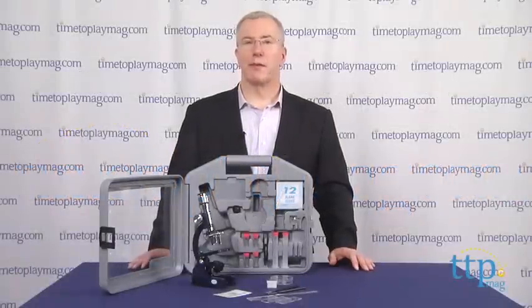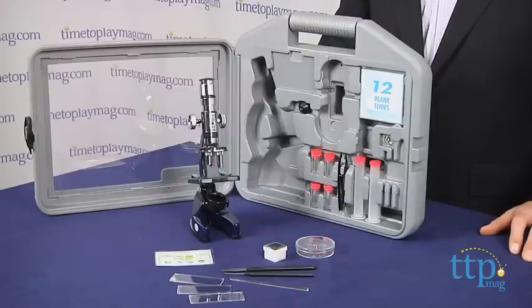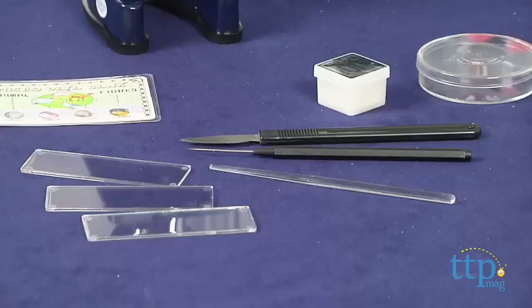Hi, it's Chris the Toy Guy from TimeToPlayMag.com, and this is the microscope set from Science Tech. It's everything kids need to set up their own beginning science lab. This is designed for kids ages 10 and up, and it does include a sharp needle, scalpel, and slicer, so kids will need to be careful and attentive when using the set.